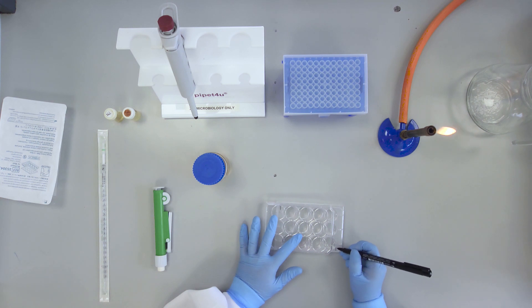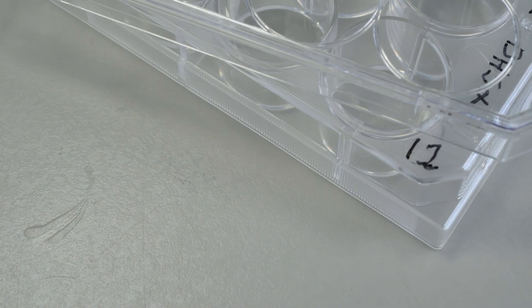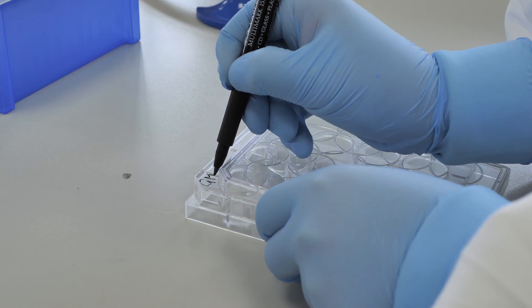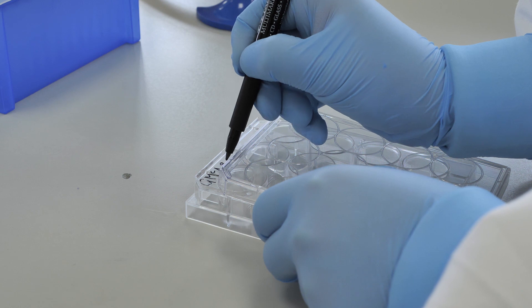Also label with your initials, the date, and the strain of E. coli to be used. Note that the plate is not left fully uncovered while carrying out this labelling.